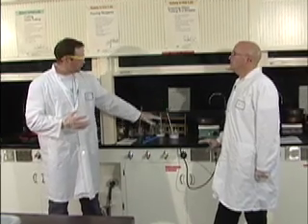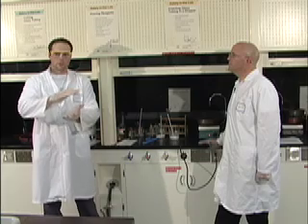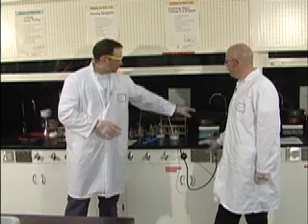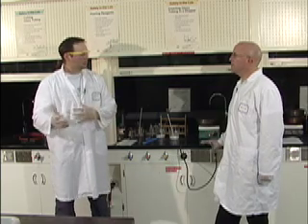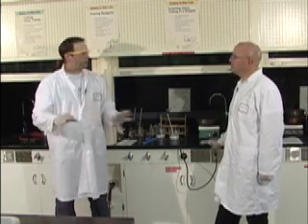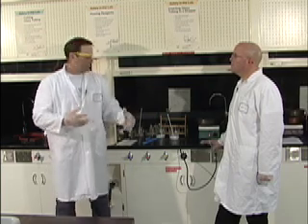So while you're breaking this up, it's a really good idea to take your 200 milliliters of warm distilled water in a 250 ml beaker and warm it. Oh, so you want it a little warmer than just tap warm? Yeah, just a little warmer than tap warm. We don't want to use tap water in our experiment because of impurities, so if we want to use distilled, we're going to have to warm it somehow.